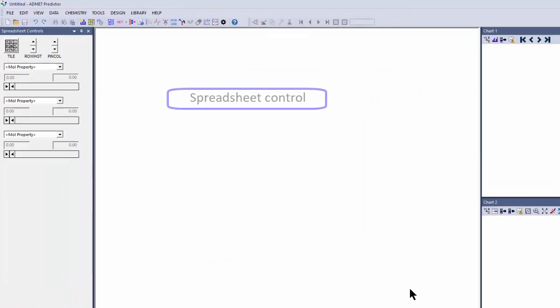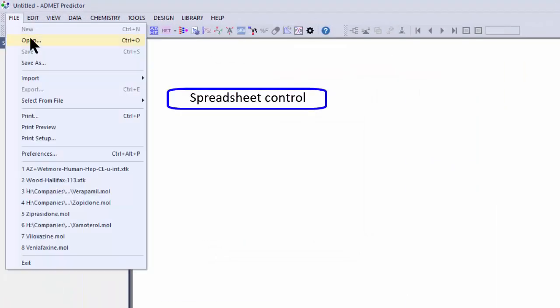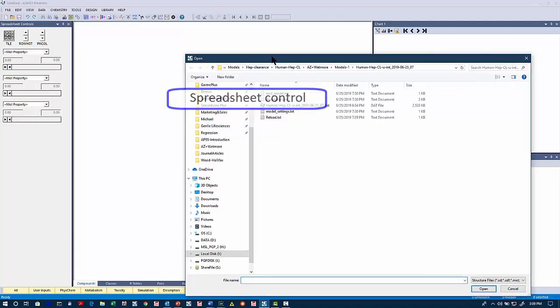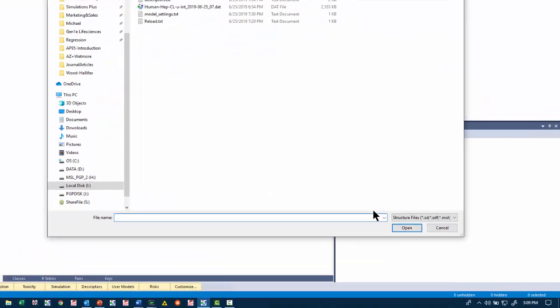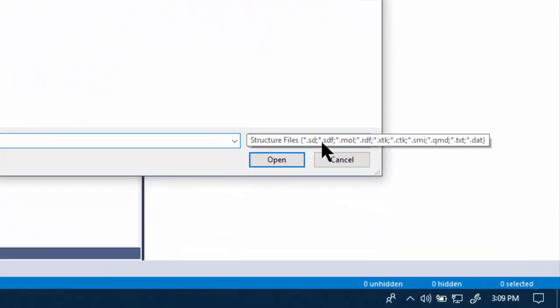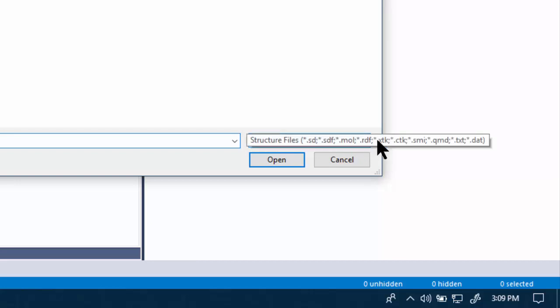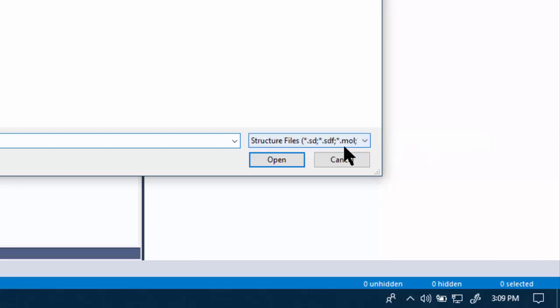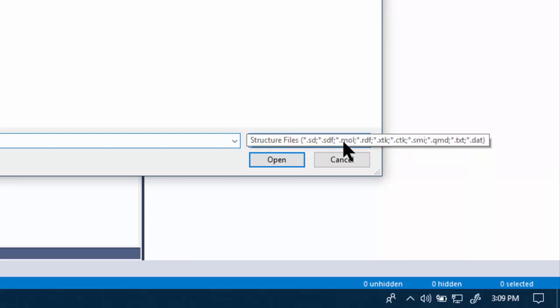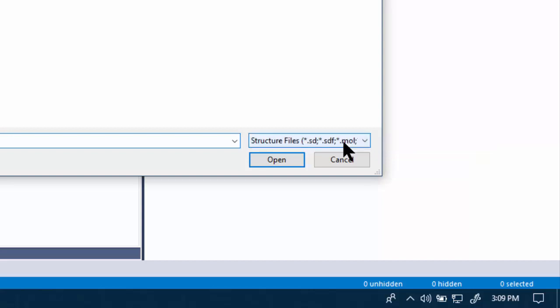We can come back to some of the settings. Let's just open up a file. There are various file formats that are accepted: SD, MOL, RDF, and also what we call SMI. XTK and CTK are proprietary formats. Specifically, the XTK is what we save the files under, and that saves all the graphs, et cetera, within the folder.